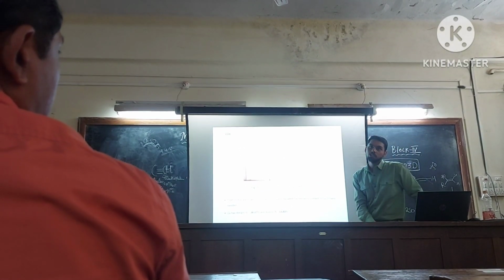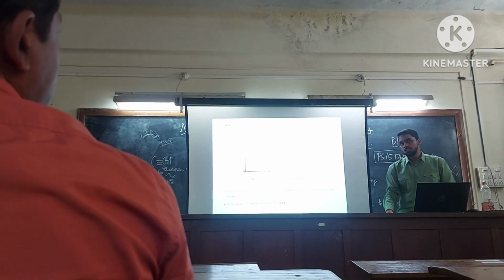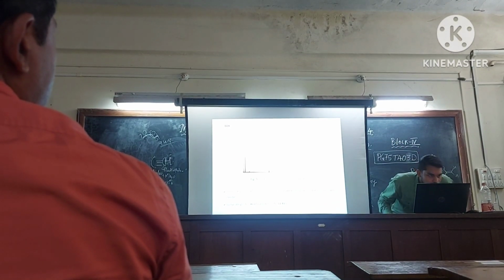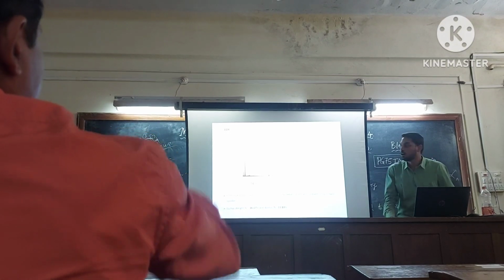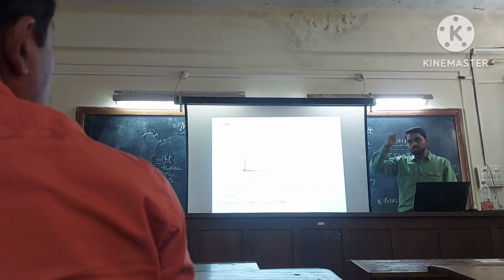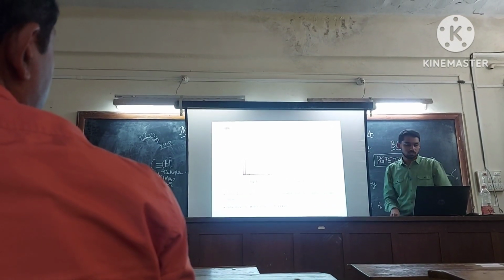36 copper, 64 is the rest. You say the carbon, oxygen. In comparison, how much oxygen is there? Calculation, is it possible, sir? Oxygen here. Now again, two more peaks will have the percentage which is there. Sir, there was a table with all the values, and I just took the top of it.